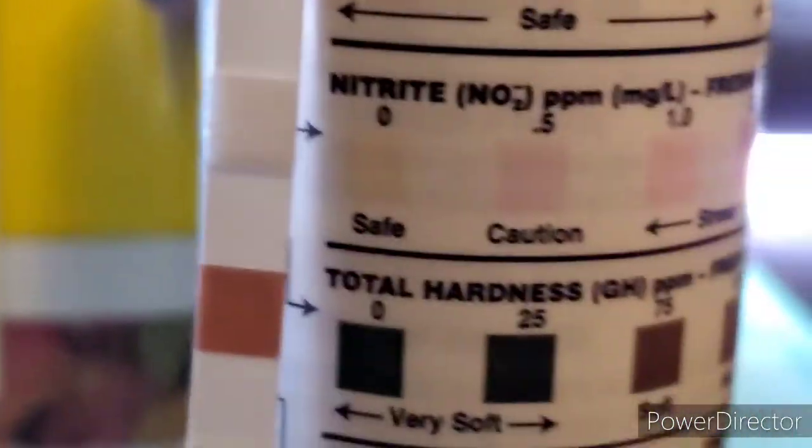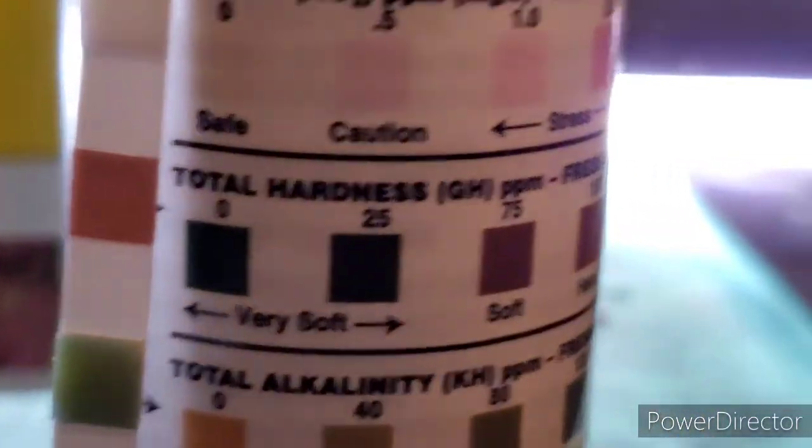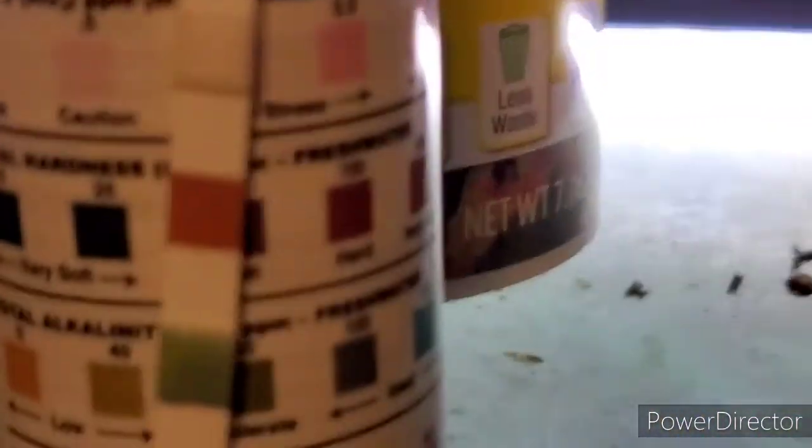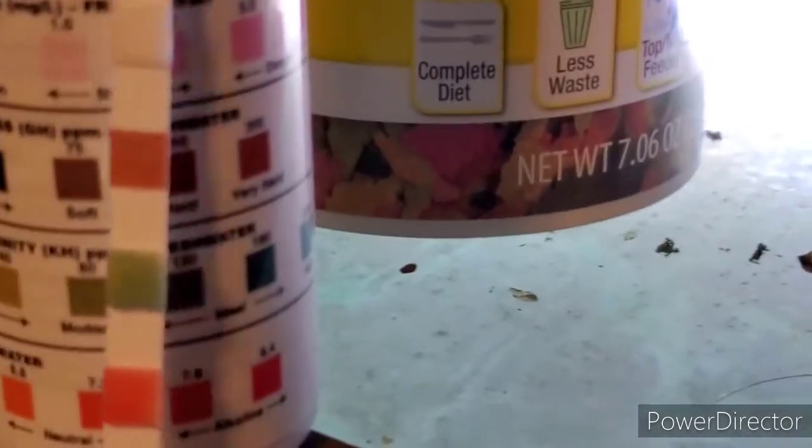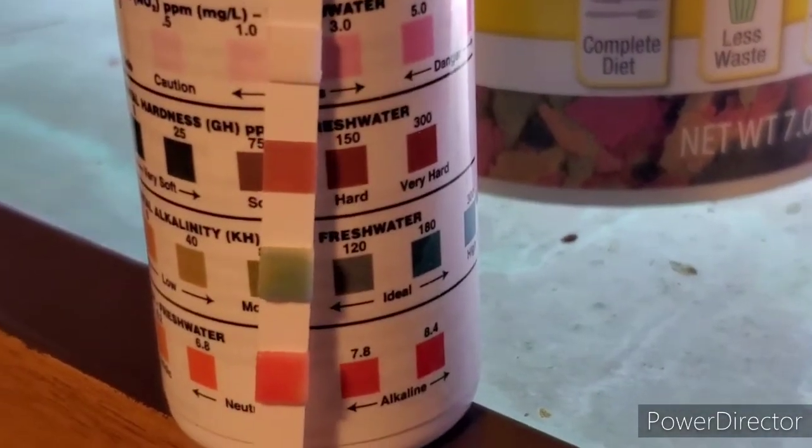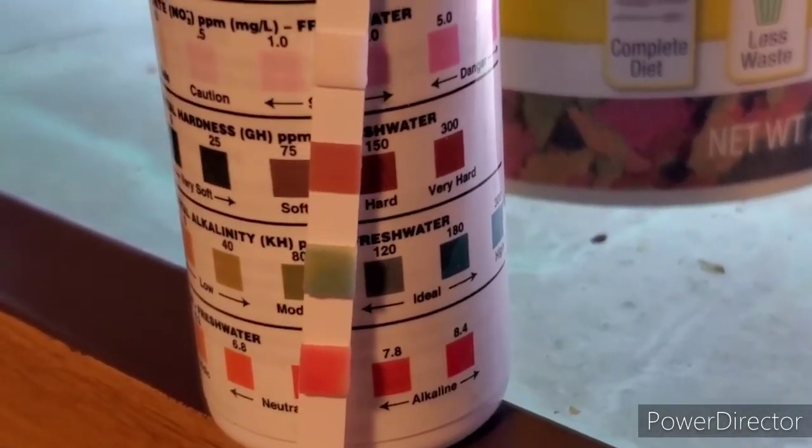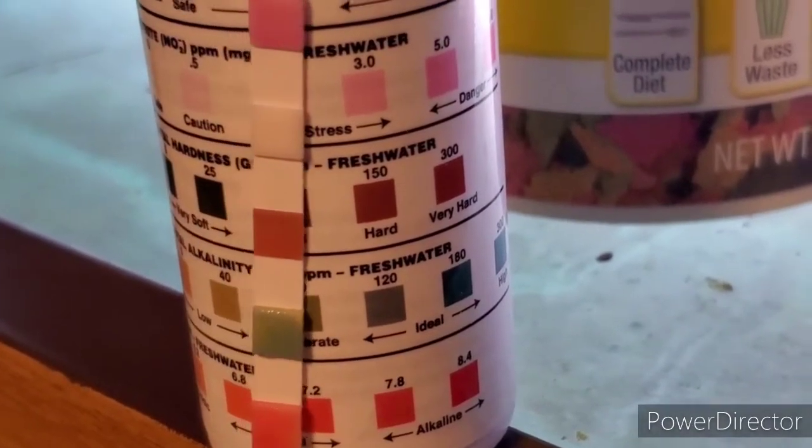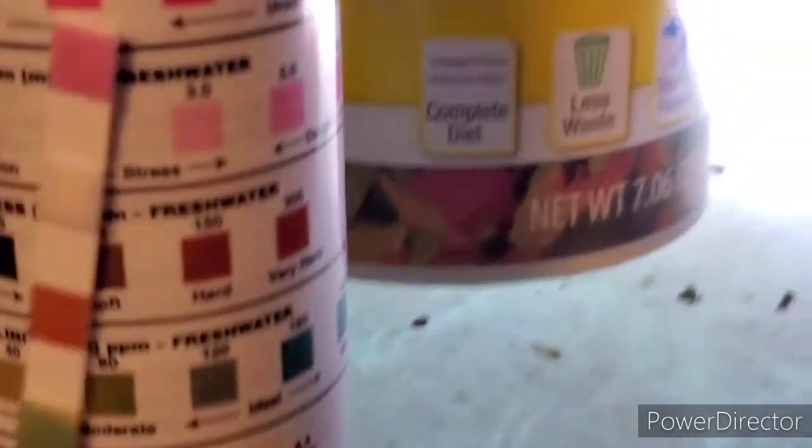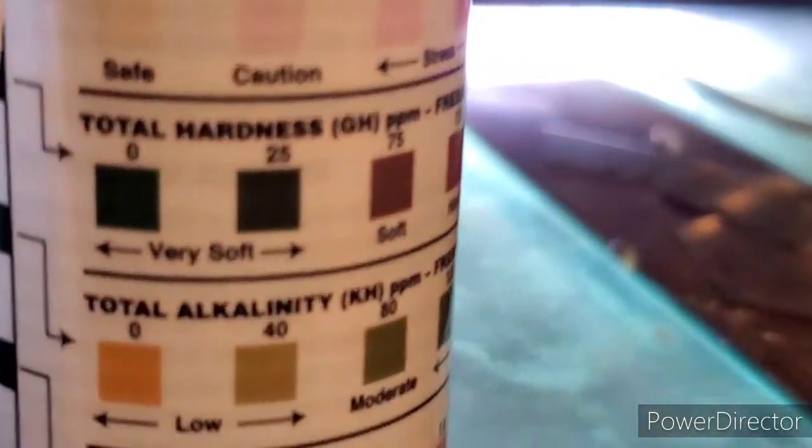So, zero, oh shoot, sorry, zero nitrite, hardness is fairly high, probably over 300, higher than I expected.